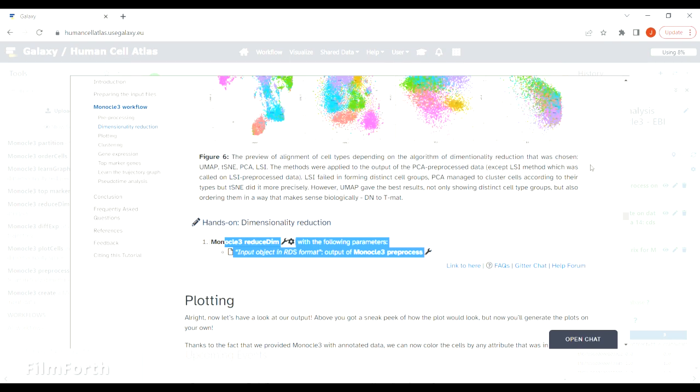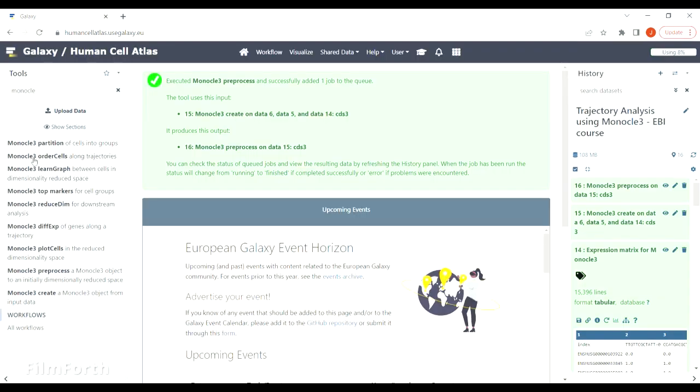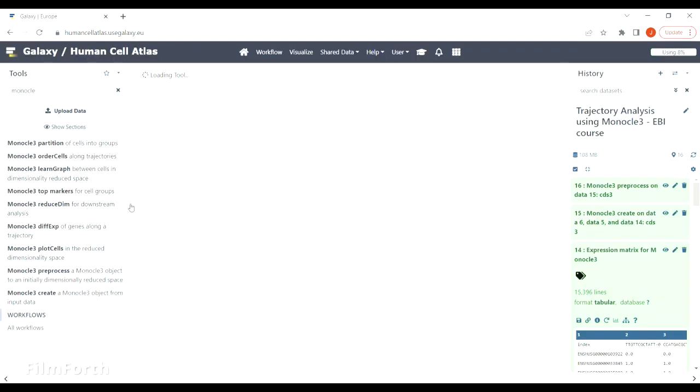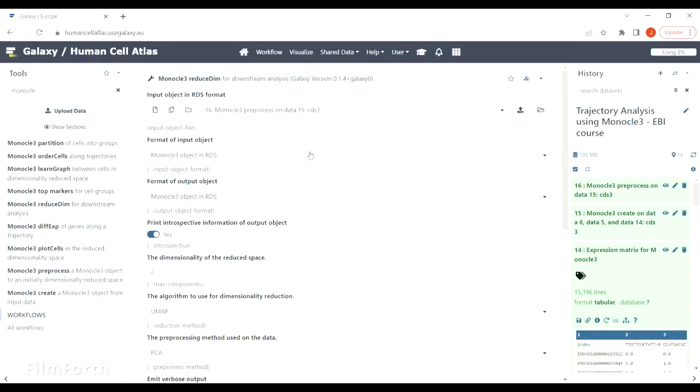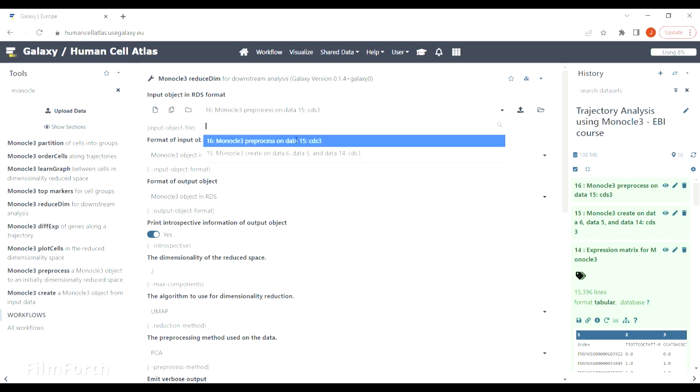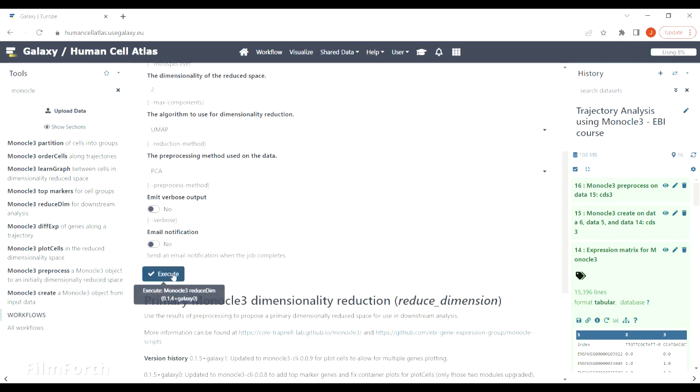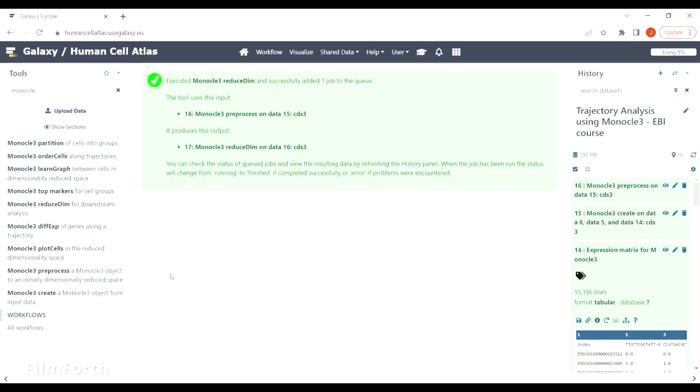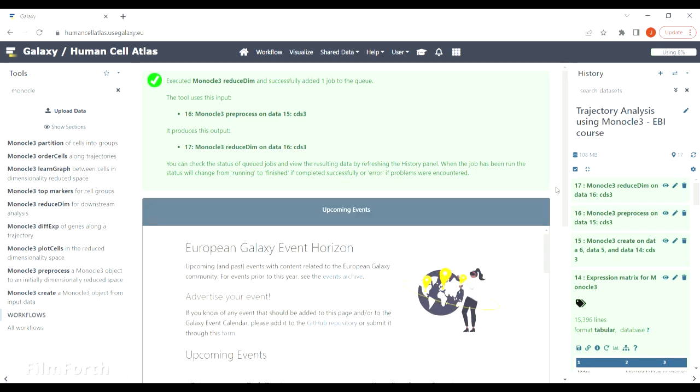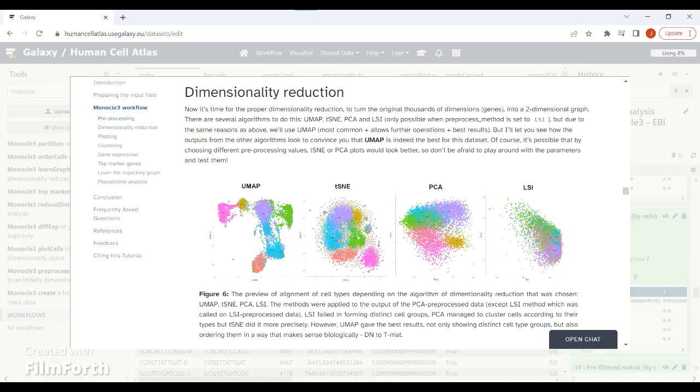Next step is dimensionality reduction. Make sure you choose the preprocessed file and accept all the defaults. Again, you can play around with the dimensionality reduction methods, all are shown in the tutorial, but we are using UMAP because it gives the best results.